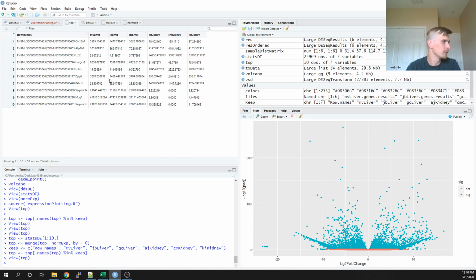so the row names and the values for all of my tissue samples. Basically what I'm going to do is assign a color to each of these values on a range from low to high. And I'm going to keep these rows and these columns in their place. Again, I'm just going to apply a color that represents this number.